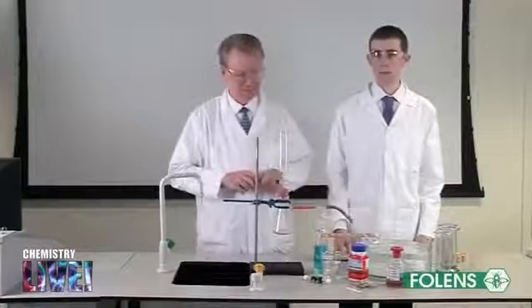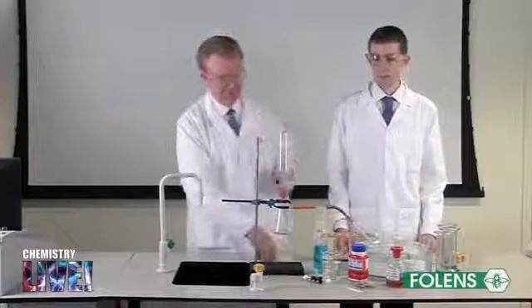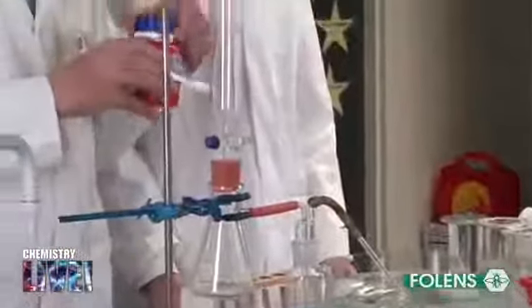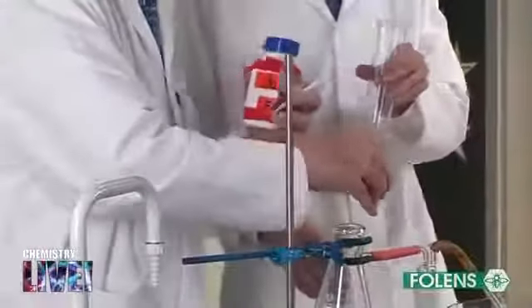Set up the apparatus as shown. Do not touch the calcium carbide with your fingers, as moisture from your hands could start the reaction. Use the spatula when transferring the calcium carbide to the flask.